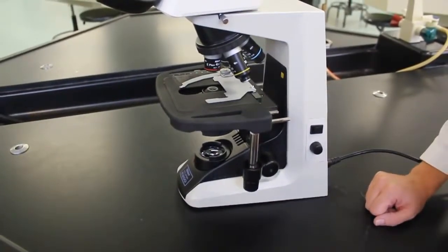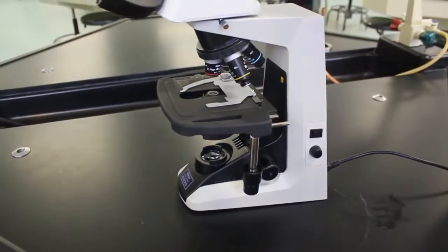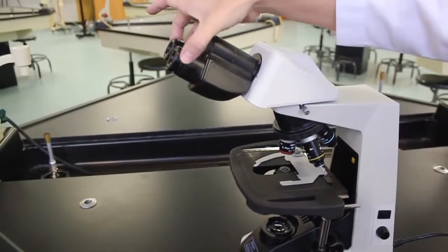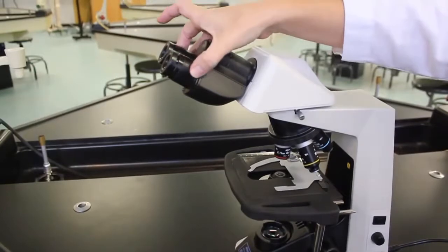To give you a quick overview of our Nikon microscopes, starting at the top, these are the oculars. They are magnified. This is what you will look through.